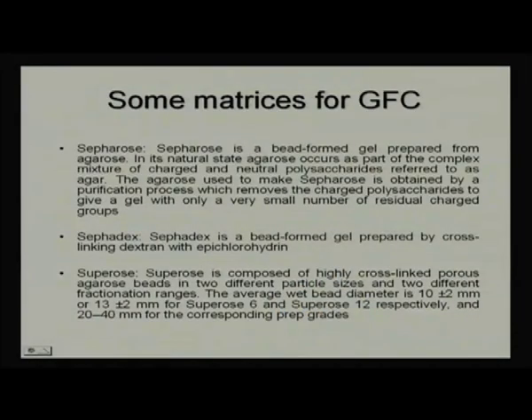Some matrices which are used in gel filtration chromatography are Sepharose. Sepharose is a bead-formed gel prepared from agarose. In its natural state, agarose occurs as part of a complex mixture of charged and neutral polysaccharides referred to as agar.